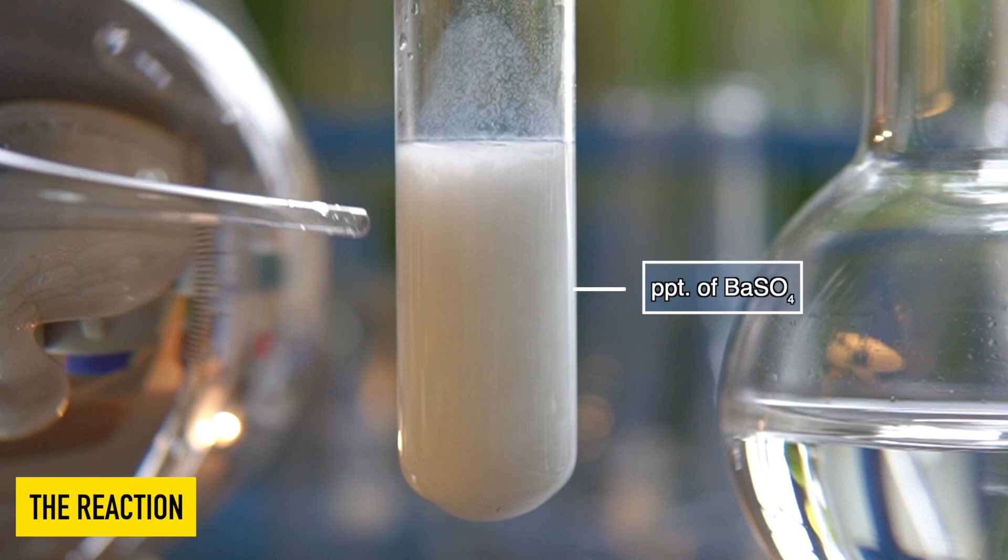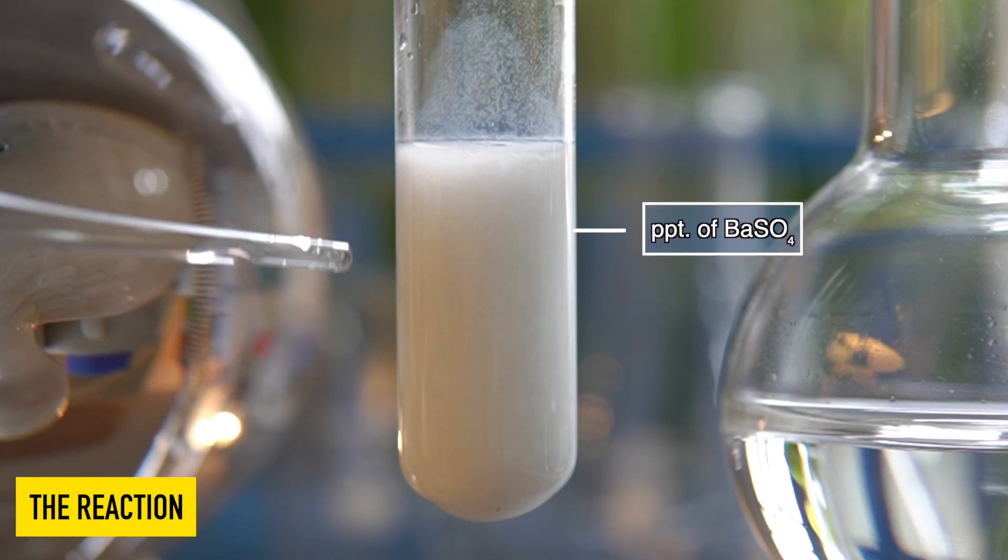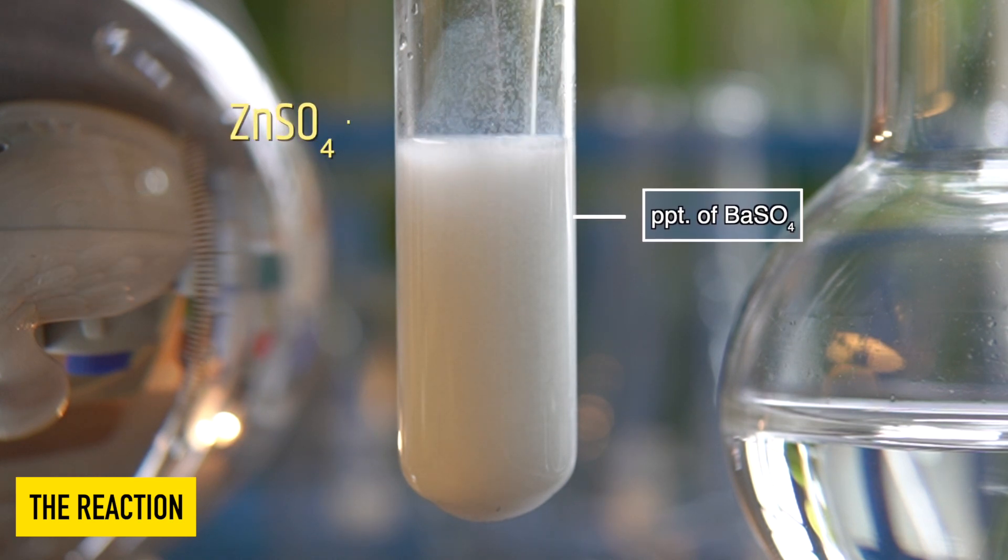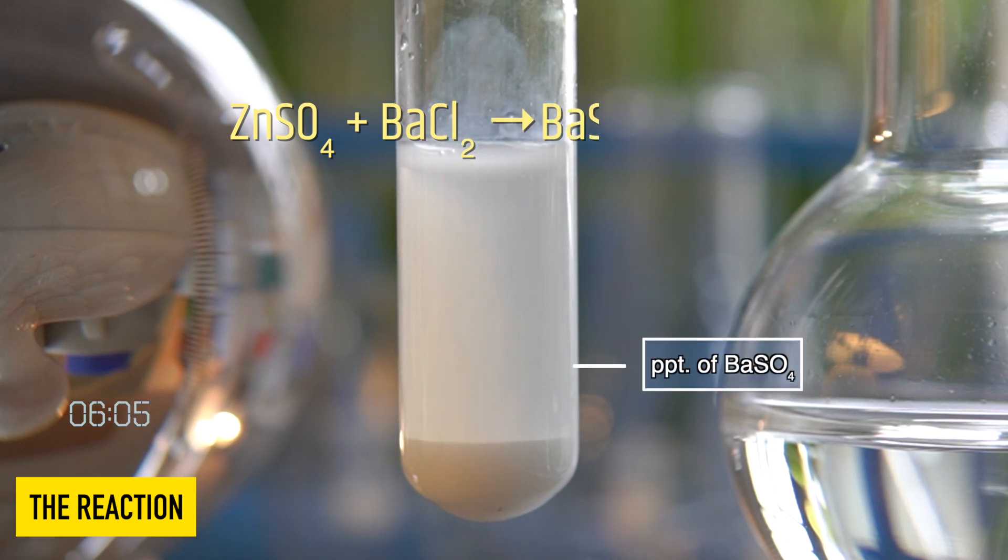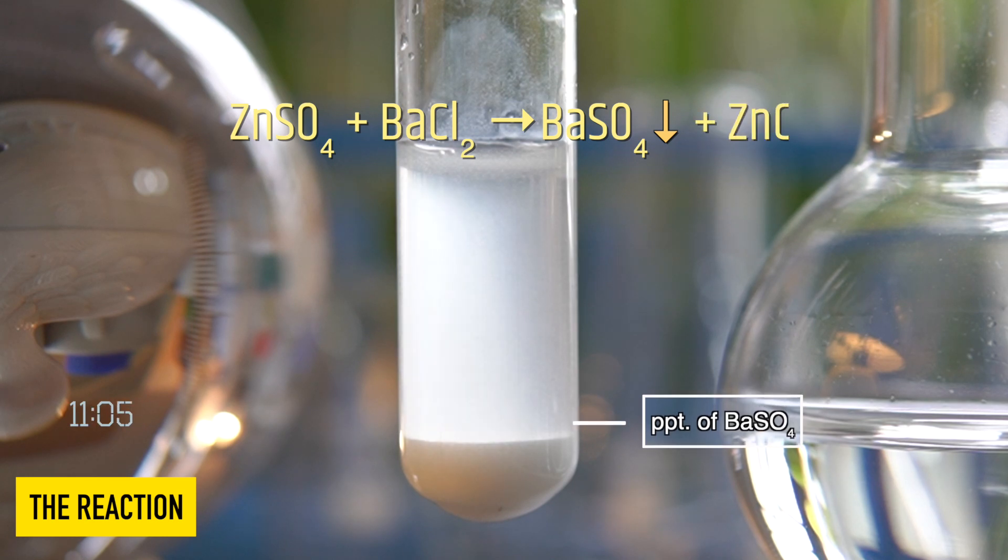The white insoluble precipitate that has been formed inside the test tube is nothing but barium sulfate. So, in this reaction, when zinc sulfate reacts with barium chloride, it will produce a white insoluble precipitate of barium sulfate along with zinc chloride.